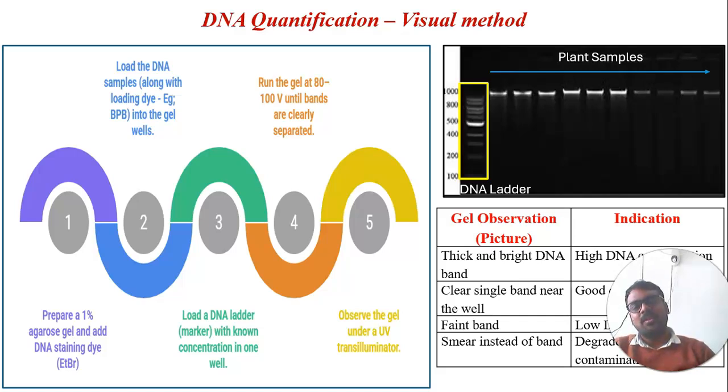Once the gel has run, what we are going to do is take out that particular gel and observe it under the UV transilluminator. Once you are observing under the transilluminator, based on the intensity of that particular band, we are going to judge its quality.